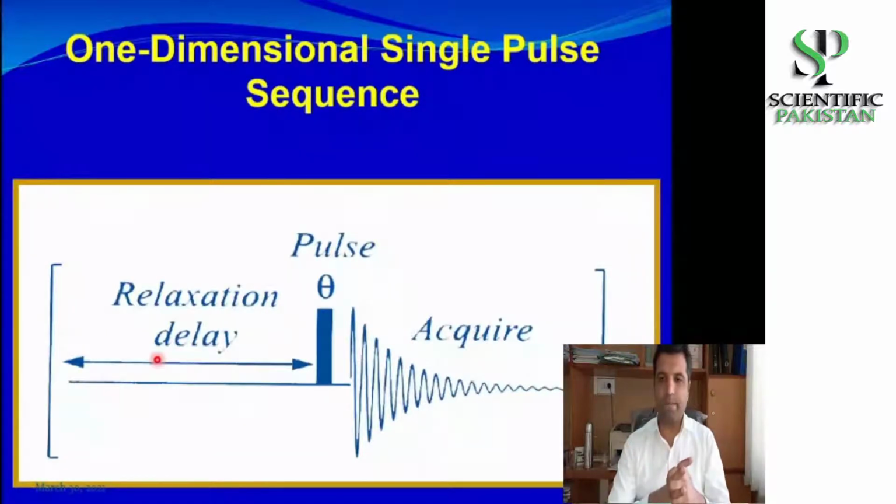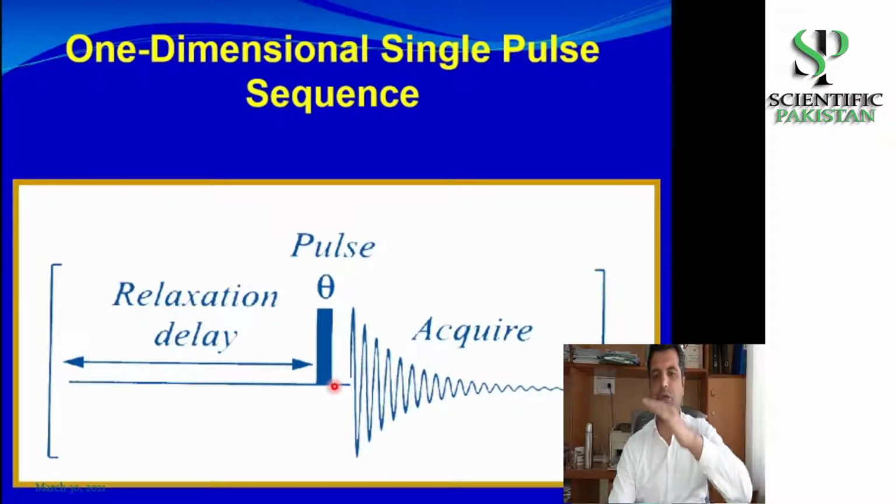This is a simple single pulse sequence. So you see here, it starts from here, you give it the pulse, and then you turn it off here, and you see that this M0 goes back, going away from the detector. The detector is on the XY plane, so here is the detector, and it goes away from the detector, and that is why you get these decaying signals. And you see that you have this wavy structure. It's a decaying signal, and that is when you are acquiring all the information about the molecule, right?